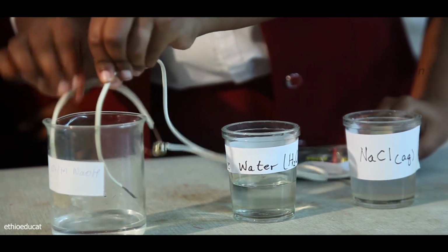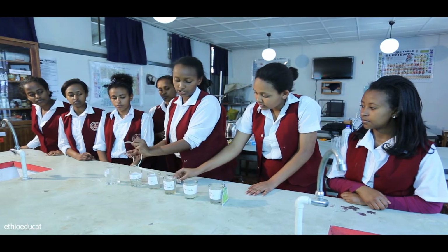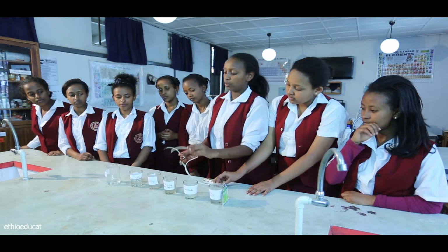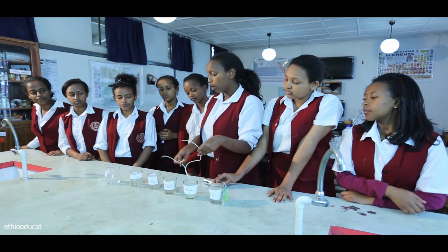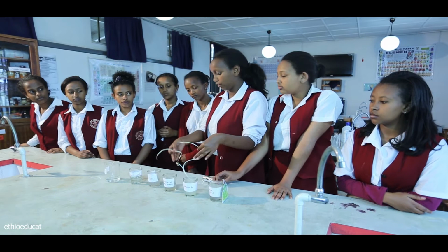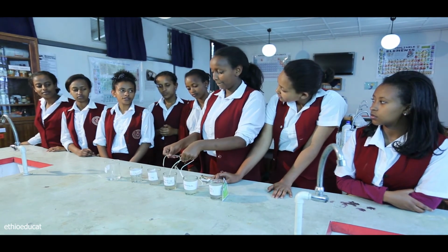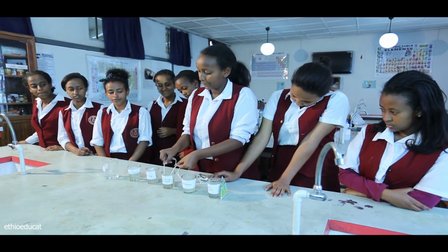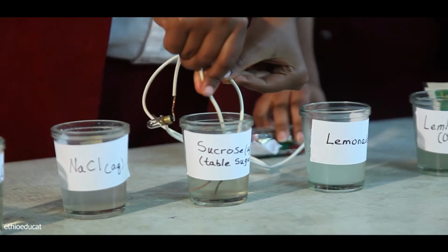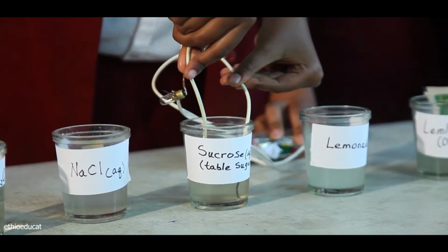So we'll rinse it again, and we'll insert it into the next compound, which is sucrose solution or table sugar solution. So what would you expect to happen? Okay, let's see. Are you seeing any light coming from this?